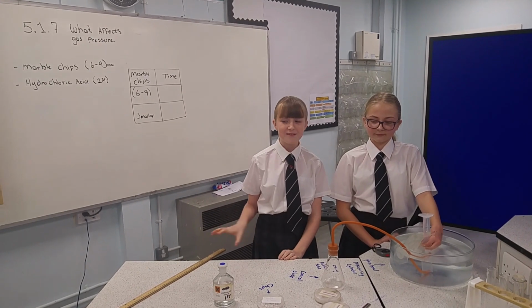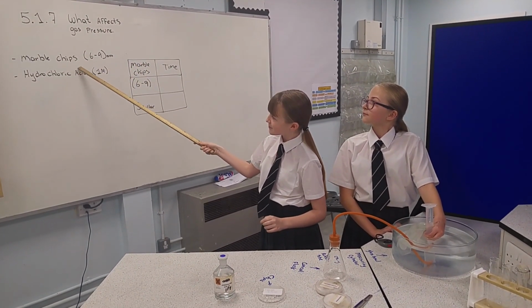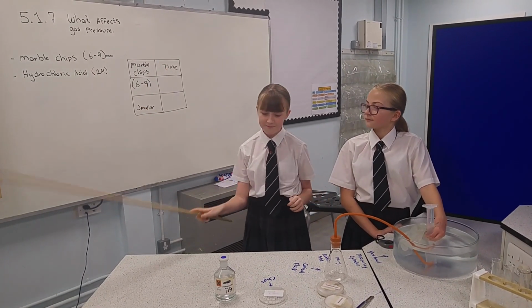Hi, my name's Eleanor and today we're going to be looking at what affects gas pressure. We're going to be using marble chips and hydrochloric acid.